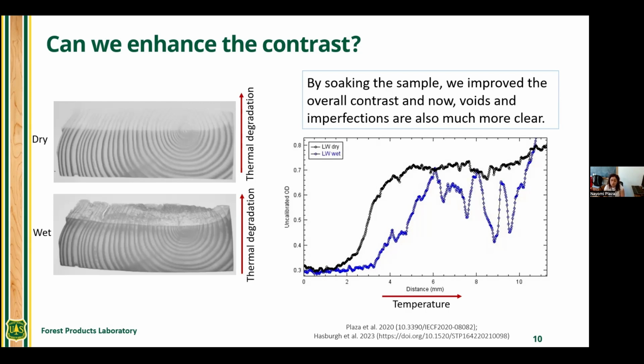Right now it's thermal neutrons that we can obtain via a compact generator close to Madison, Wisconsin. We have started to include these experiments as part of our regular sample characterization techniques before we do X-ray scattering experiments, for instance, where we're doing scattering-based tomography to look at the differences in the crystalline domains as we char the samples.